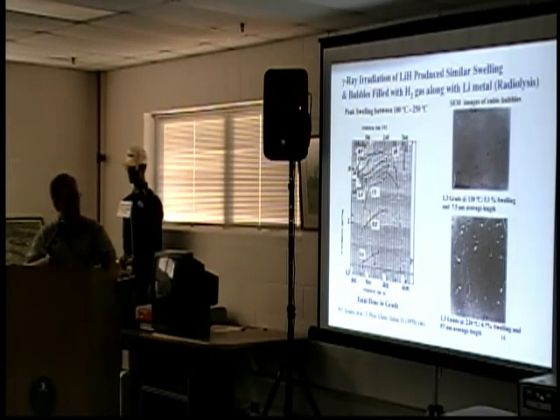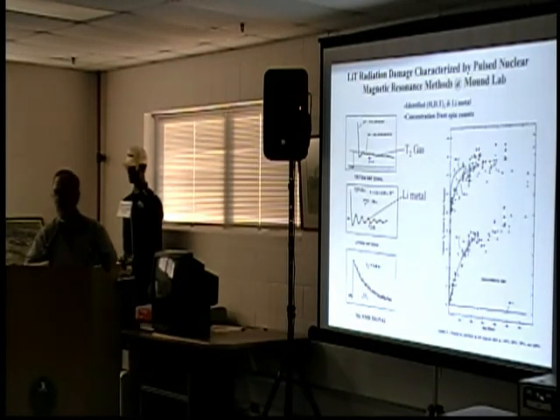Well, the next slide shows data we took at Mound, and this is pure lithium tritide. We were impatient. We wanted to understand what happened in a relatively short time. We didn't have 6 or 7 years to sort it out. And so these are actual spectra. This fast decay, that's the tritium signal with, I'm sorry, like 10 microseconds.